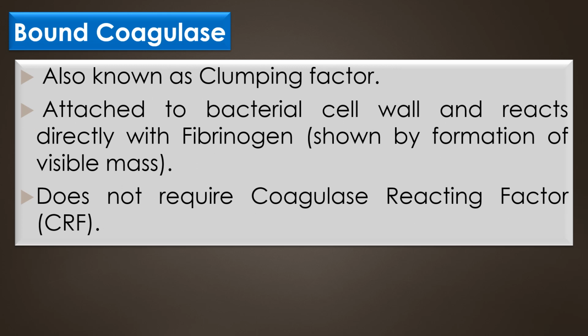Bound coagulase. Bound coagulase is also known as clumping factor. Bound coagulase is attached to the bacterial cell wall and reacts directly with fibrinogen. This is shown by formation of a visible mass. It does not require coagulase reacting factor or CRF.